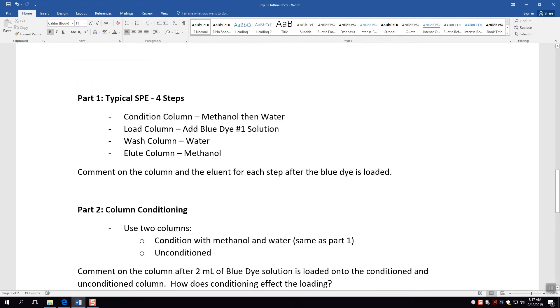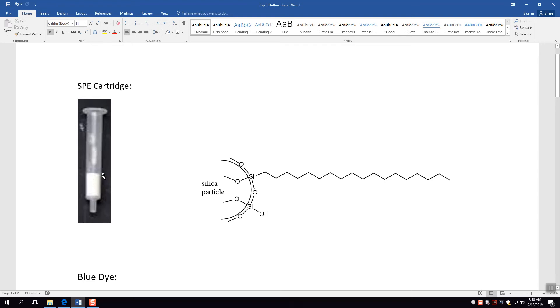Finally, we're going to elute the column with methanol. One of three things can happen. Let's say we get that tight blue line of all the food coloring. The first thing that could happen is the blue comes completely out, and what we end up with in our test tube is blue liquid containing methanol. Be careful with methanol — it's a little bit toxic and it's flammable. Don't drink it and don't set it on fire. The methanol coming out blue means the methanol effectively got the blue food coloring away from this C18-OH group, which means the molecule is able to be eluted.